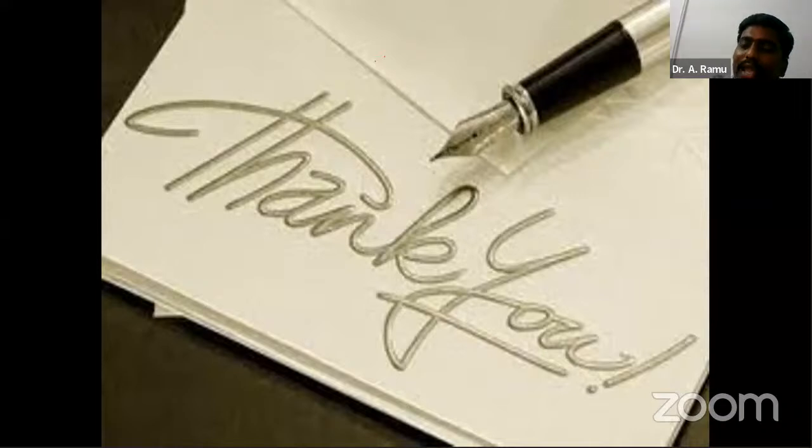When you take a sample, an equal volume of the sample has to be replaced with an equal volume of fresh dissolution medium. ఎందుకంటే to maintain the sink condition during the dissolution, మన సింక్ లో బ్లాకేజ్ లేకుండా ఉంటే ఎలా ఫ్లో అయ్యిందో drug release కూడా, if at all it is maintained at a low concentration, it will be released uniformly, right? So any more questions?